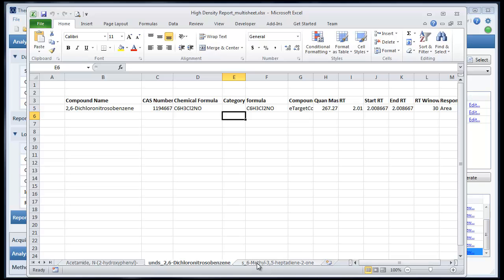You'll notice that there is a 31 character length limit for sheets, and so the last 31 characters are taken so that those sheets can remain unique and valid. Any invalid symbols are also stripped out: question marks, colons, backslashes, etc.